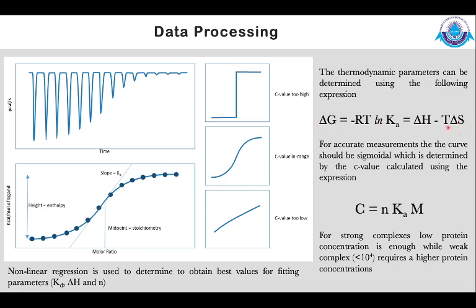From that, I will be able to get the T delta S value, or just delta S value. Obviously, we know the temperature, since we already fixed it in the experiment. There is one small experimental setup point we have to pay attention to: depending upon the molar ratio, that is the concentration range, you might end up getting only this part or this part. That means you would get different types of curves.